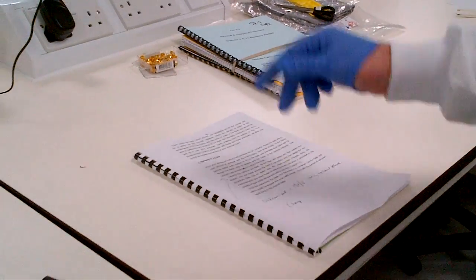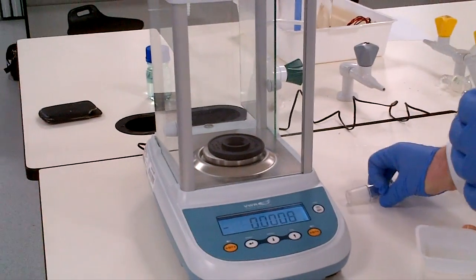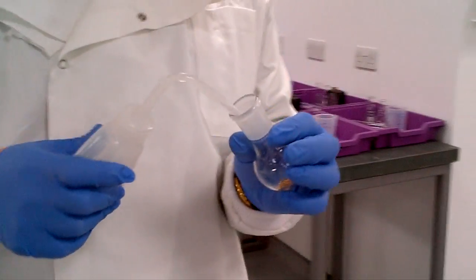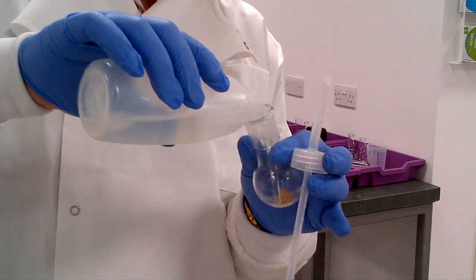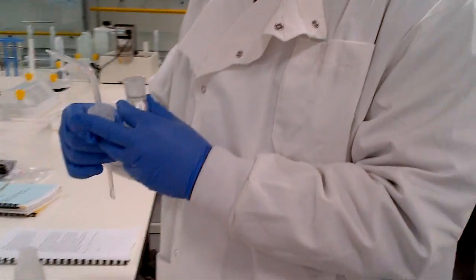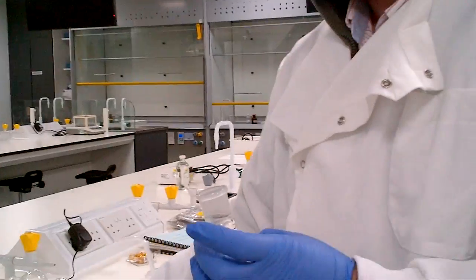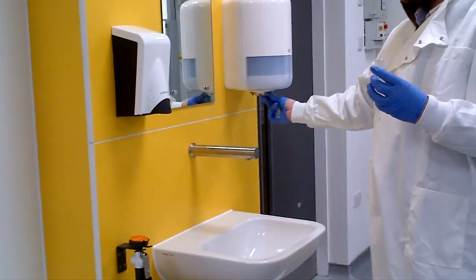And then we've got now the mass of stoppered flask plus water. So as it says here, we need to now put water into the flask and do what we've previously done. So we'll take our water bottle and we'll put some water in. So again, I'll take a bit more water, pour in, put the water towards the top part of the flask, on the neck. So for filling, take the stopper. And then I'm going to go towards the sink area to do this. I'm going to grab some tissue paper.